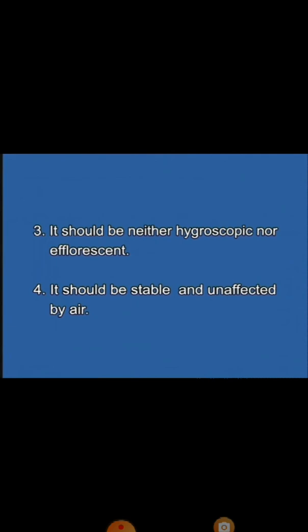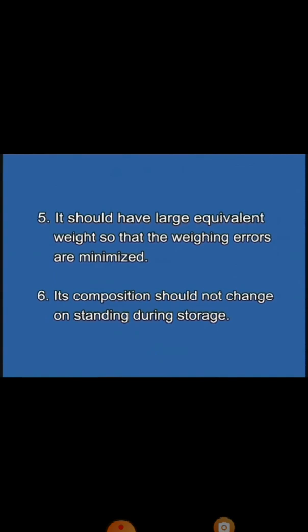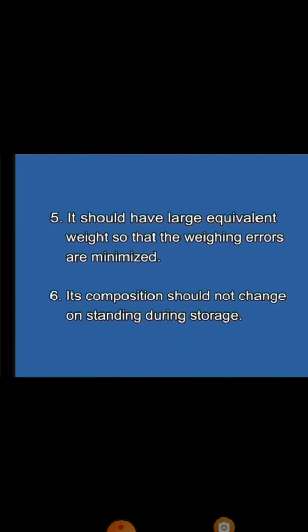Fourth, it should be stable and unaffected by air. Fifth, it should have a large equivalent weight so that weighing errors are minimized. Sixth, its composition should not change on standing during storage.